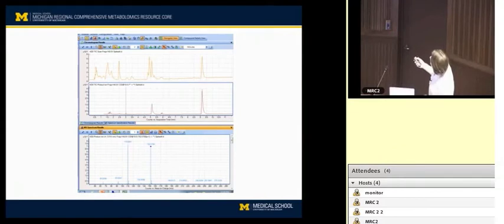I think this is a similar thing, just saying that we have an extracted ion chromatogram, and then we have a total ion chromatogram. Obviously, even if you have an accurate mass, and you've done an extracted ion chromatogram and filtered down to a pretty tight mass range, you may see multiple peaks in the spectrum that represent the same mass. Now, if you're lucky and your mass accuracy is good enough, these peaks represent constitutional isomers of each other.